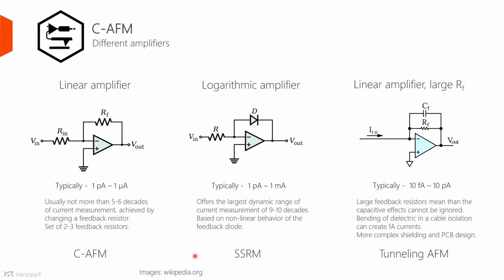Sometimes you need to measure a very large range of currents in one image. The linear amplifier cannot offer you a large range because it inevitably saturates. Even if the amplifier doesn't saturate, often there are well-conducting and poorly conducting regions inside the same sample area. In that case, your current image might be black and white without showing the transitional colors. And to highlight these transitions, it would be better if it is shown on a logarithmic scale.